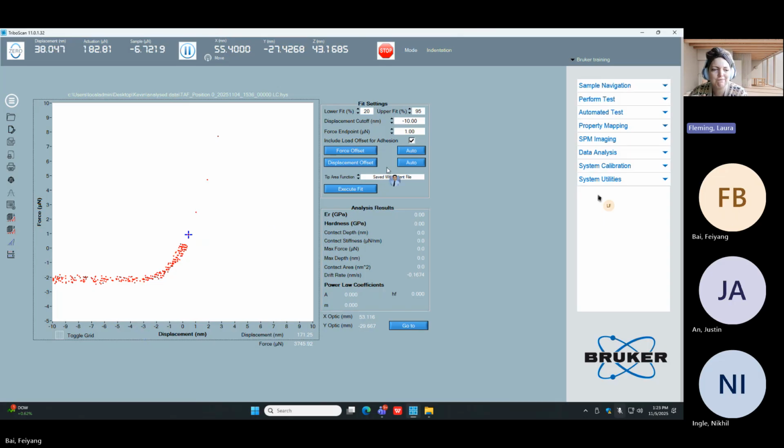I usually do like -8. And the reason for that is that what we are trying to do right now is practice settings on this curve, and then we're going to take all those settings to the other curves. And there's going to be some variation in where that lands, so we want to give it a little bit of wiggle room. I'm pretty confident that everything behind -8 will always be 0, that the variation won't be that large. So let's choose our displacement cutoff to be -8.